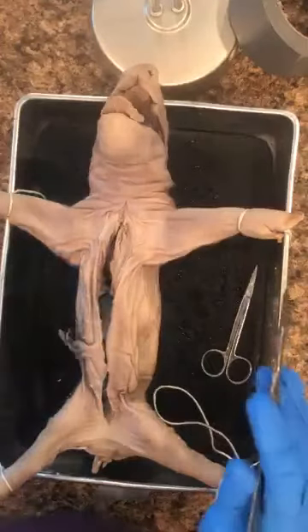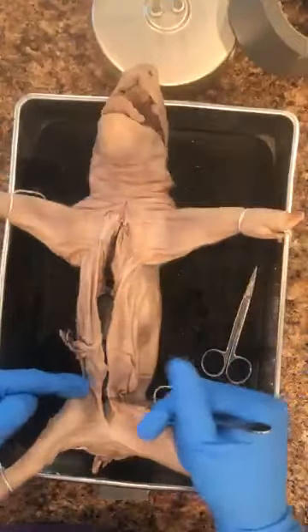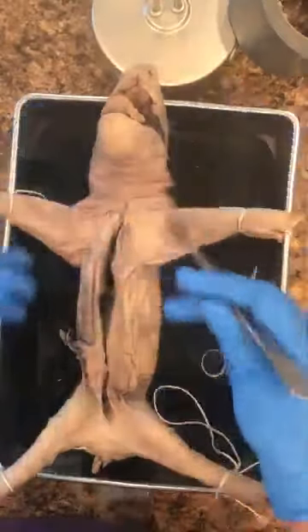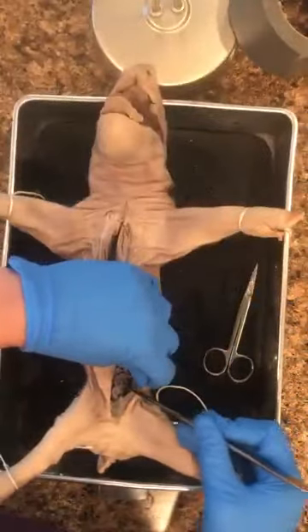All right, at this point, I need you to open the pig up. So I'm gonna make some cuts down along the sides here. I'm trying to go like this so that you can open the pig up and you can see a lot more.